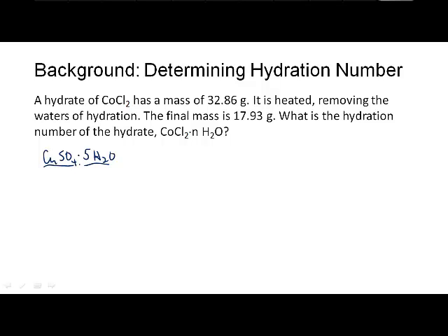It's not wet, it's not damp. Those are part of it. We want to do an experiment where we find that number for a different compound. We'll do an example here to show you how the experiment works and how the calculations work.